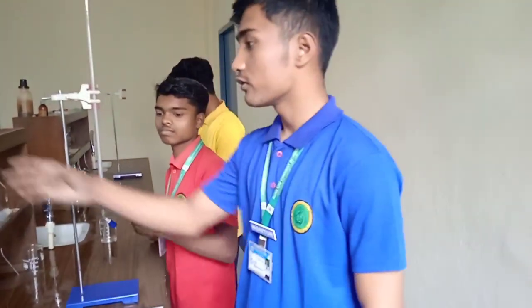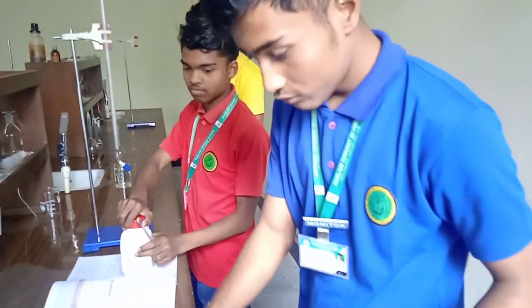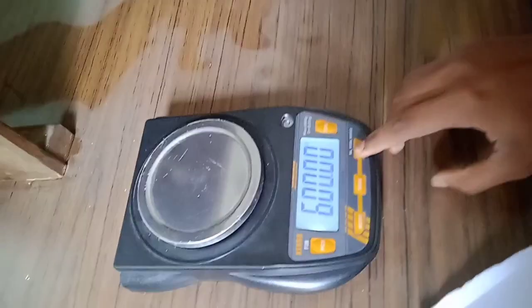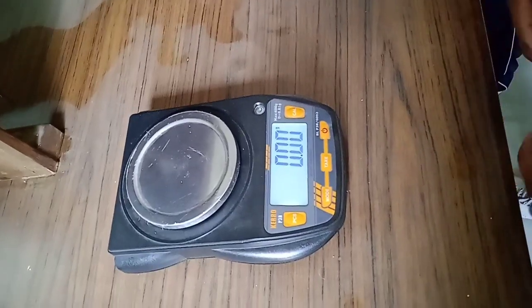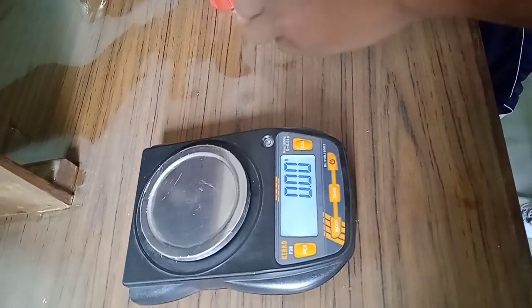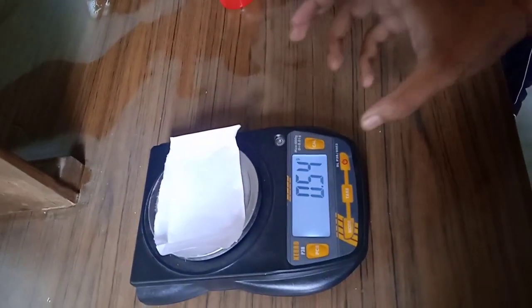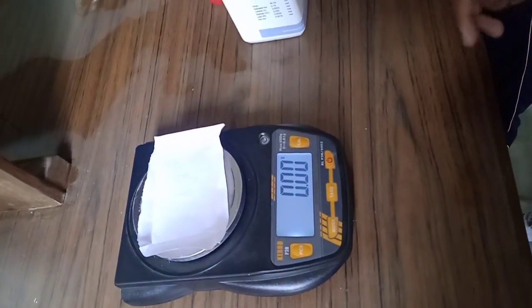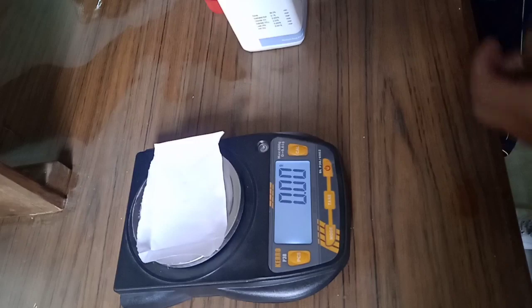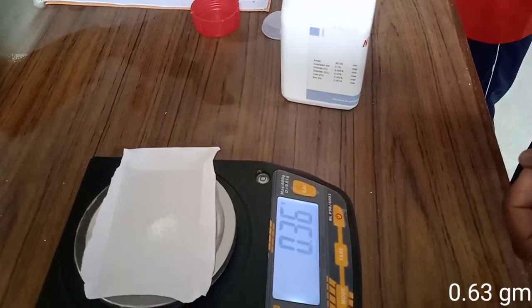So first of all we have to take oxalic acid and put it on the meter — we have to switch it on. As you can see the reading went to zero, then we have to add this paper slowly. As you can see the weight has increased, so we have to tare it so the paper weight becomes zero, then we have to put the oxalic acid to an amount of 0.63 grams.